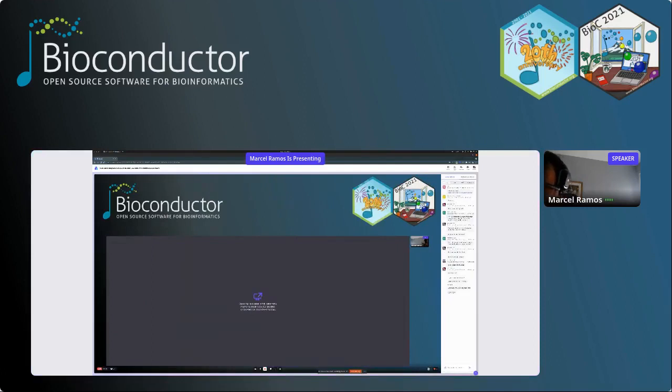Now let's take a poll here and see how many people have used some of this software already. Are you familiar with curatedTCGAData?